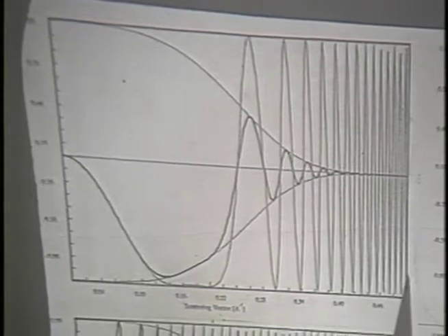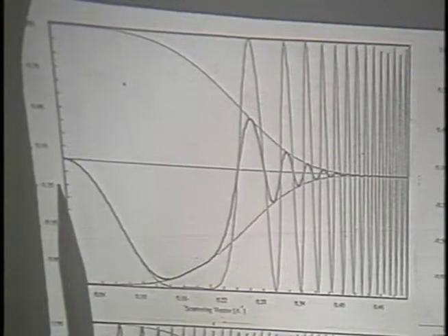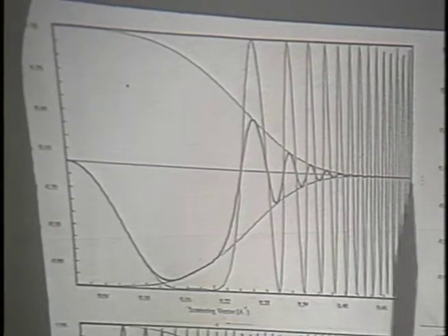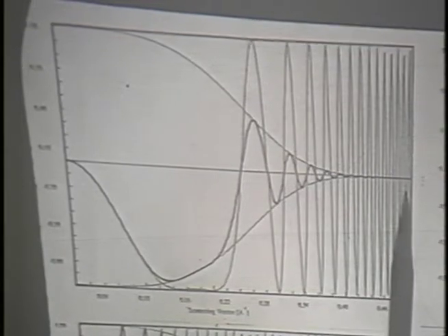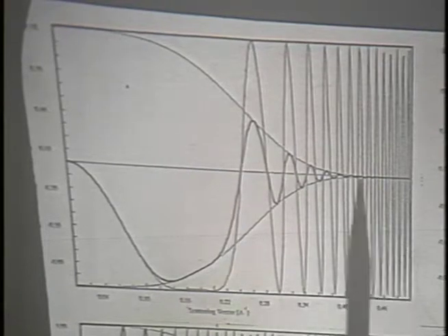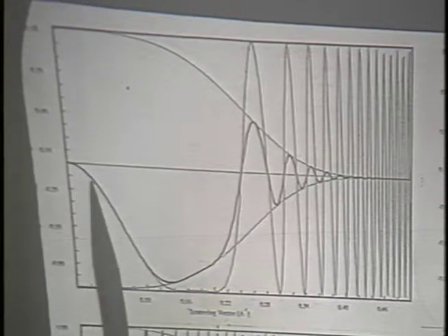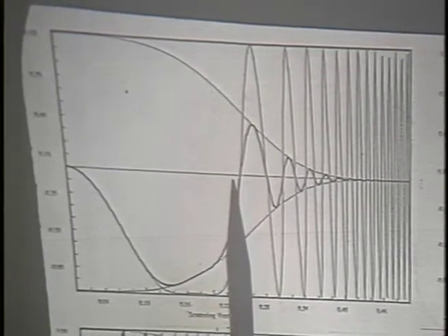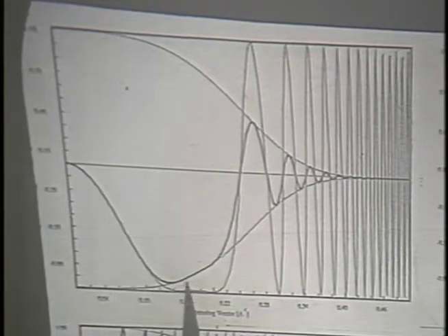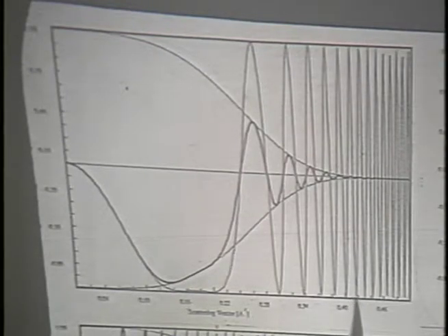The horizontal axis here is the resolution. This goes from very large spacings to spacings that get smaller as you go farther out here. The limit in these plots is about 2 angstroms. So what you see here is that somewhere around 3.5 or 4 or 5 angstroms, the dark curve goes through 0. Now, the sine function is this curve that wanders back up and down between the plus and minus 1 limits here.